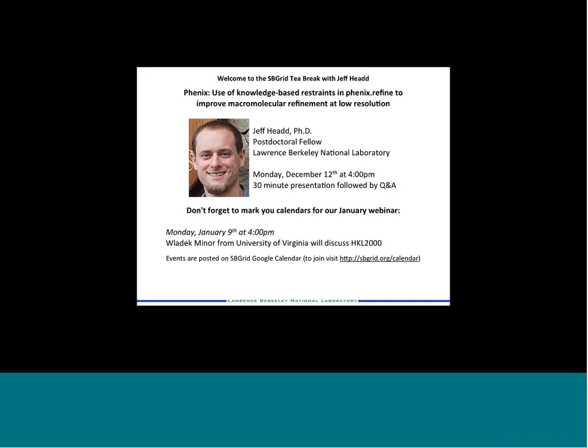Thank you very much, Jeff. I have a couple of questions here for you from Tirumala. He's asking at what stage of the refinement one should apply those knowledge-based restraints. In their lab, they typically do it towards the end, when the refinement has kind of converged and they're fixing rotamers. Would you worry about it throughout the process, or what is your recommendation here?